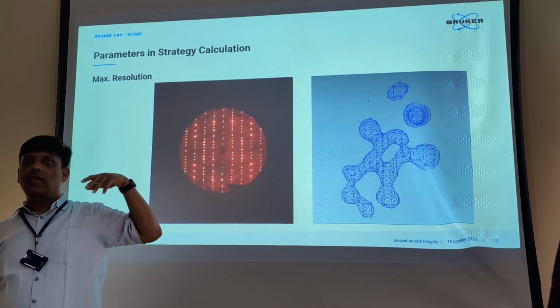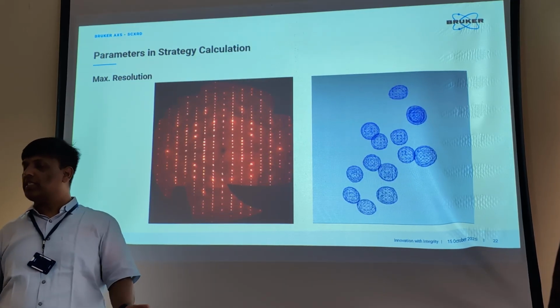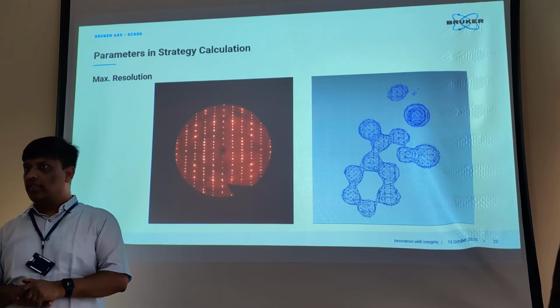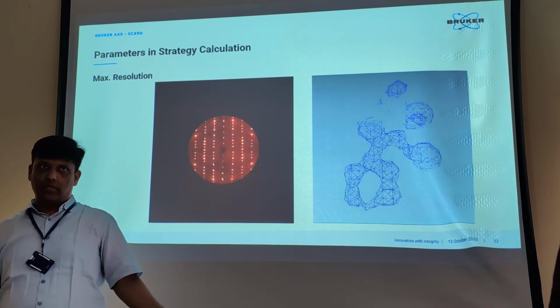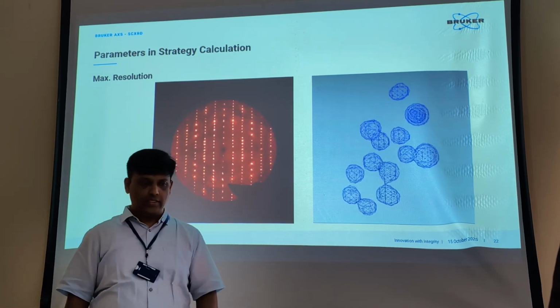Okay, so that is why you try to get as best a crystal as possible to attain high resolution. Similar in small molecular crystal. If there is a crystal which is not giving high resolution data, then again you will not be able to solve it. But chances are less in comparison to the proteins. Okay.